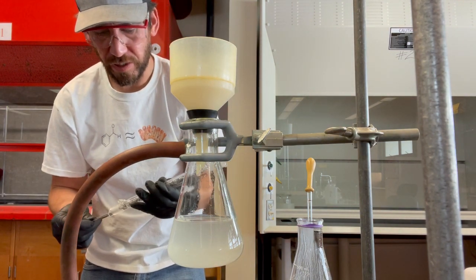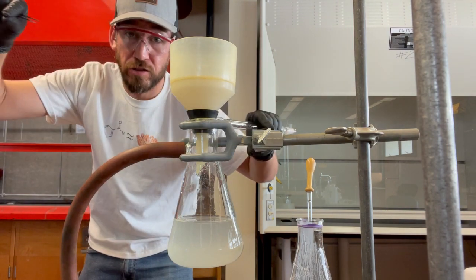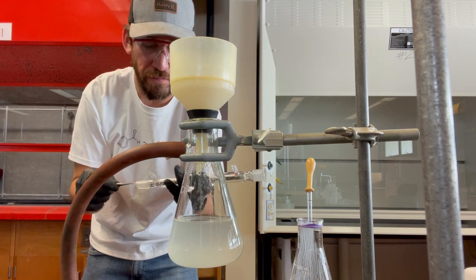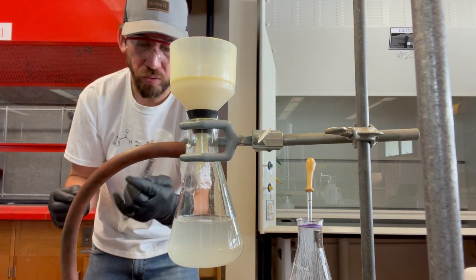And so right now what I'm doing is just packing it. Just wanted to show you that. I basically just shoved a long strand in there and pushed it down with a piece of something, right? Whatever you got to do. That wasn't bad.